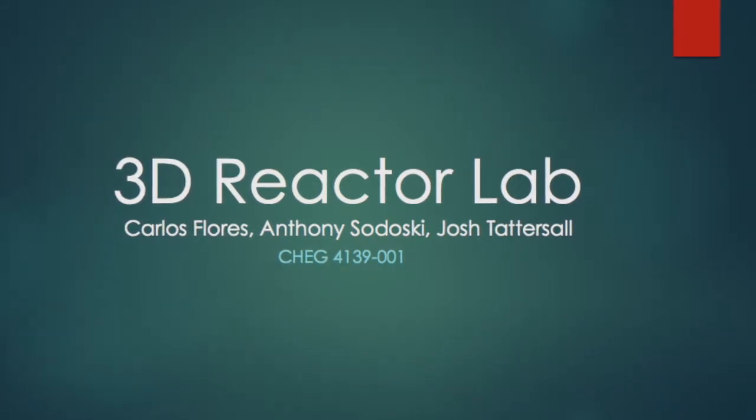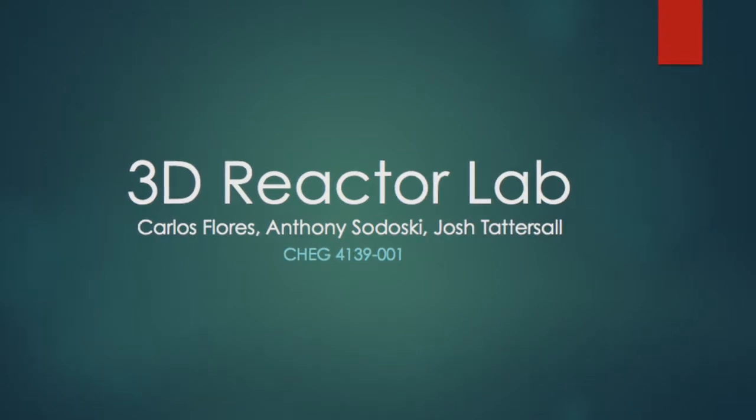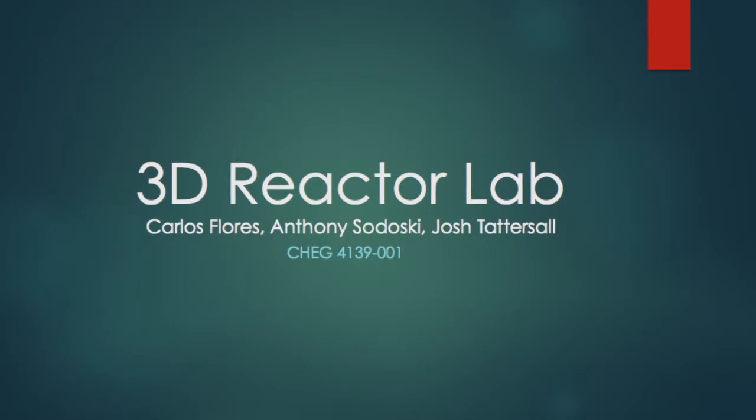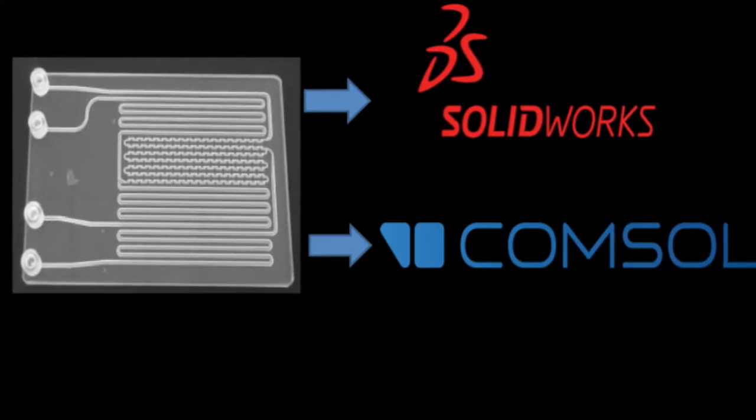the 3D Reactors Lab. We're going to be taking a look at the theory behind this experiment, looking at how the mixing occurred in our printed 3D reactors, and taking you guys through the data collection techniques and analysis of our data. The purpose of this experiment is to design a continuous microflow reactor with the assistance of SOLIDWORKS.